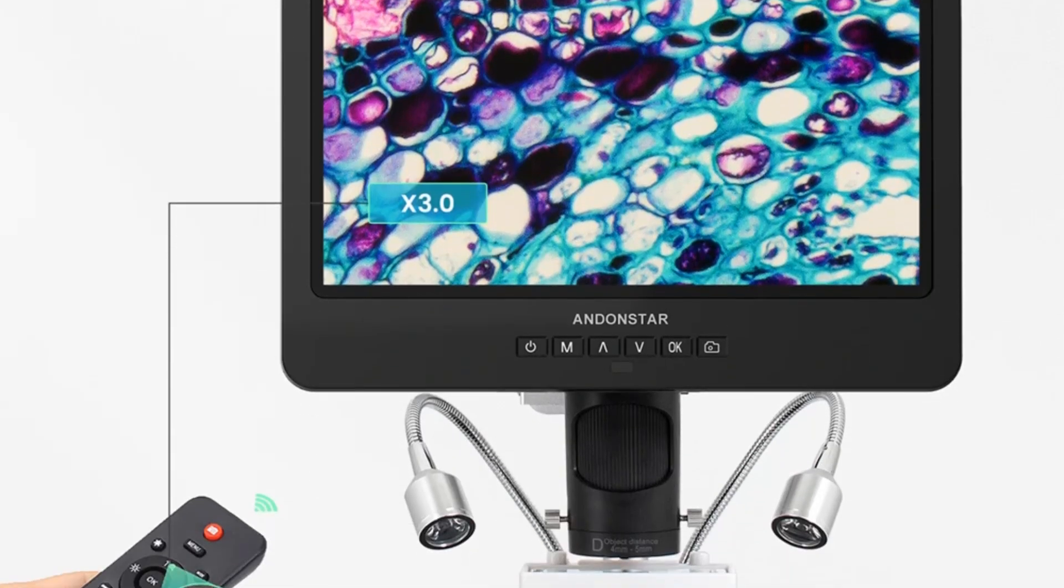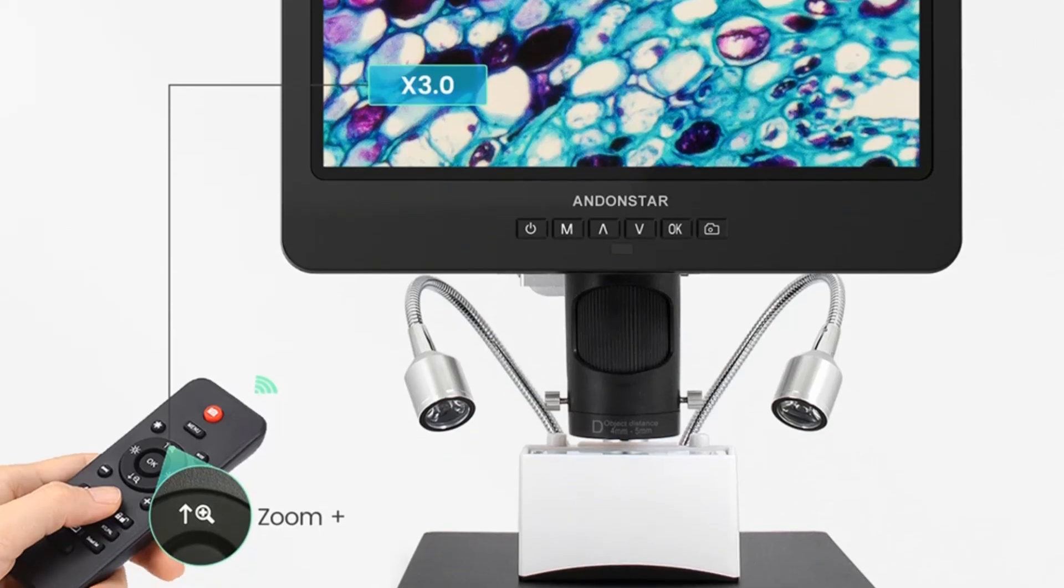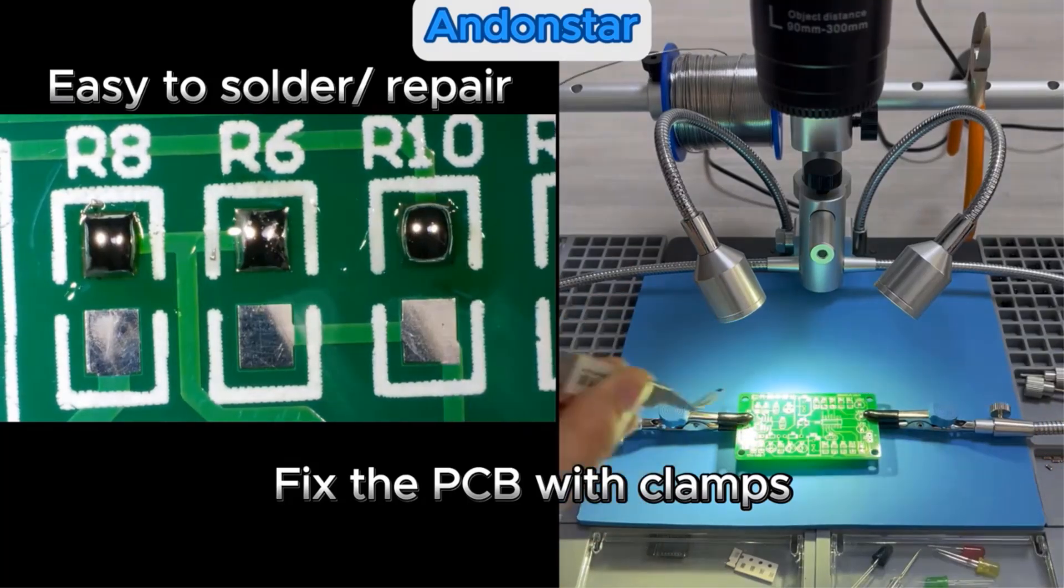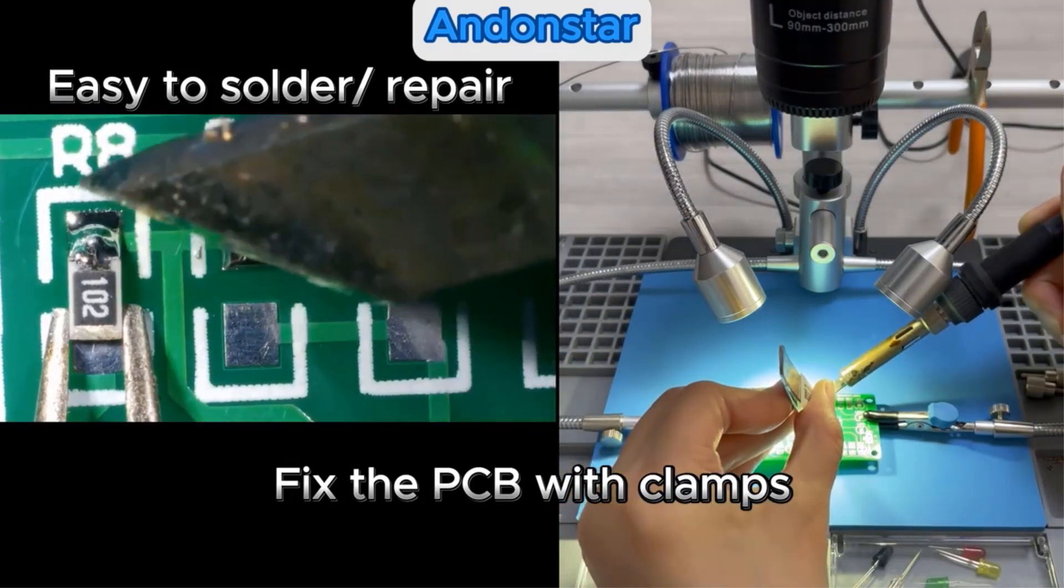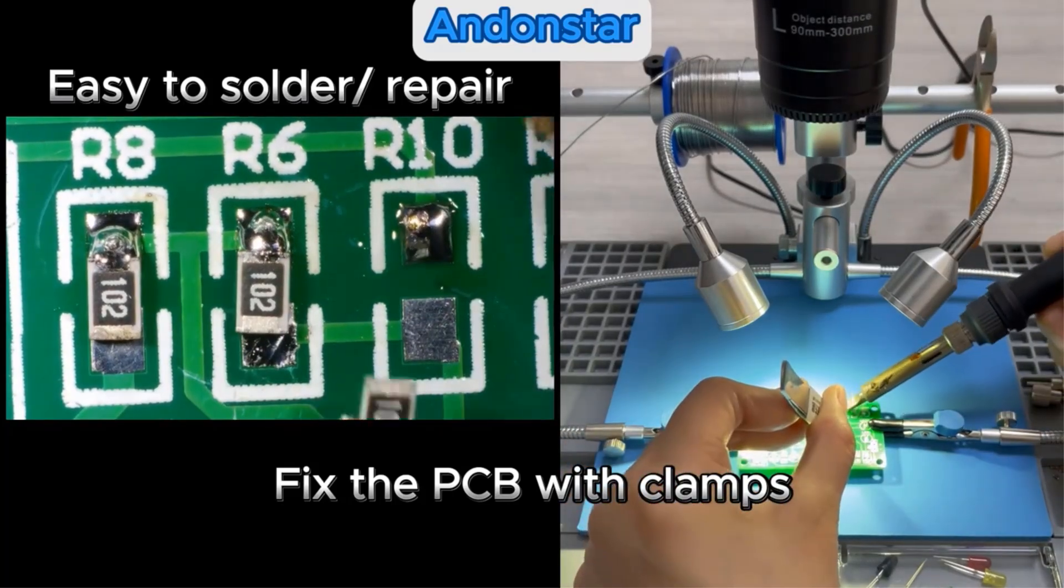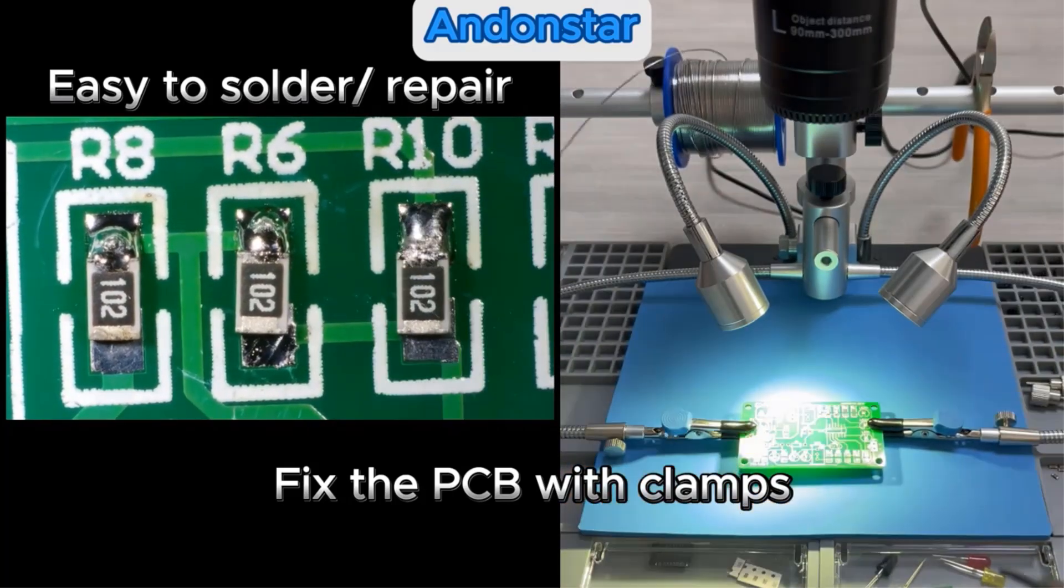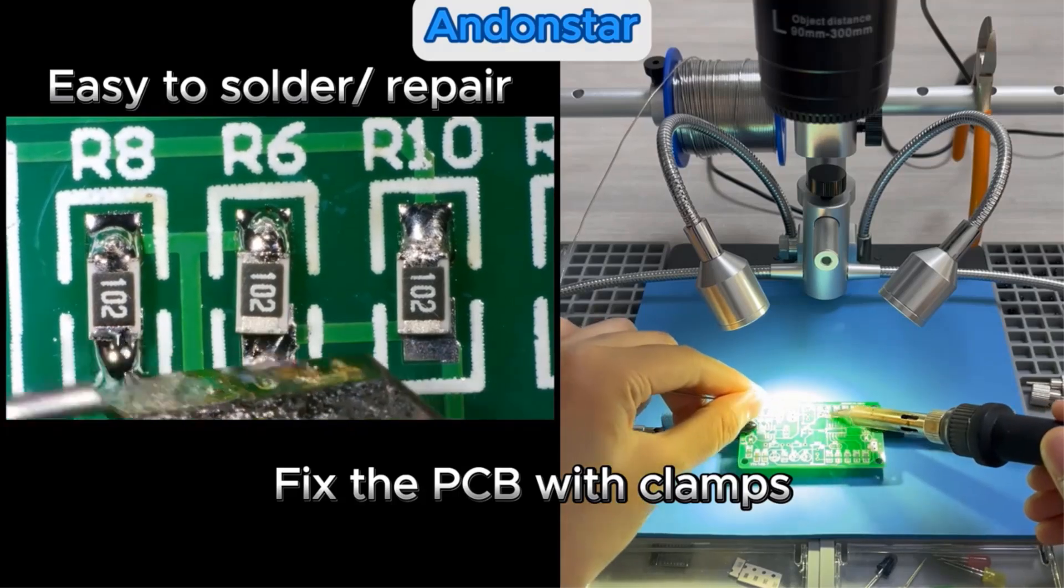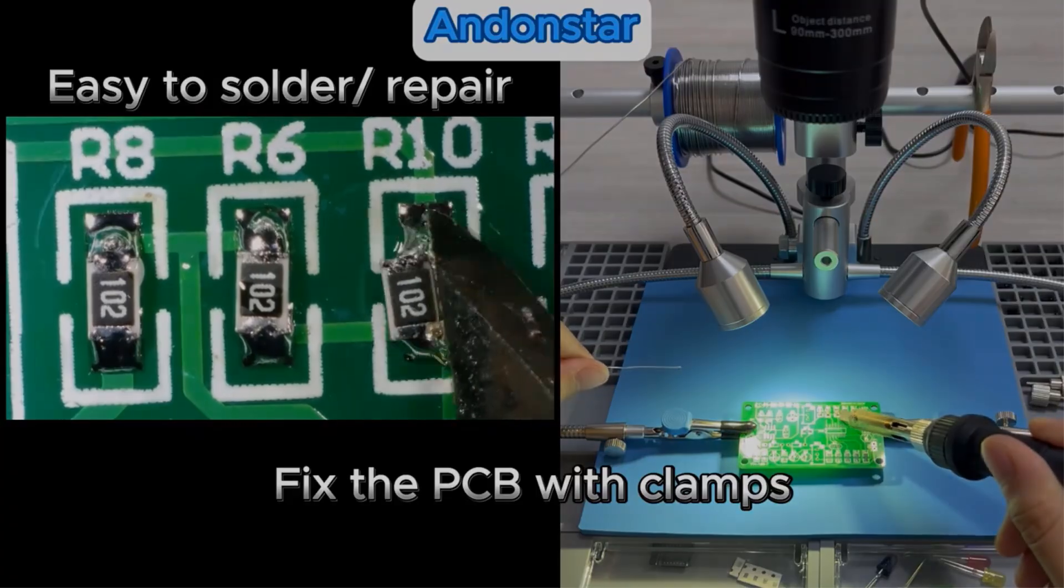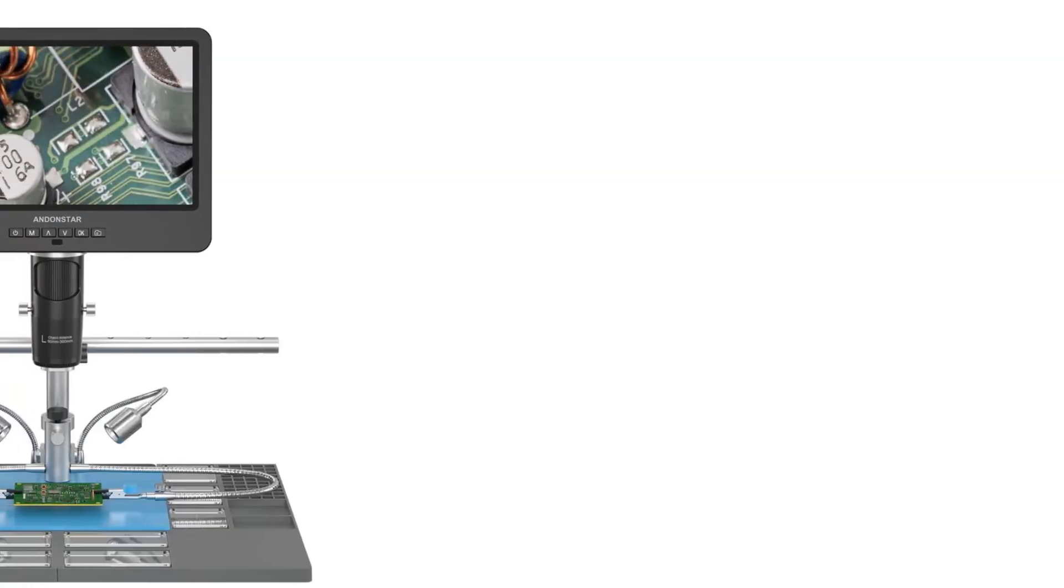It boasts a 4-megapixel imaging sensor, providing video output in UHD 2880x2160 at 24fps, as well as different HD resolutions, and captures photos at a maximum resolution of 4032x3024. The device supports video and photo formats such as MP4 and JPG, respectively, with storage capabilities through a microSD card, up to 32GB.